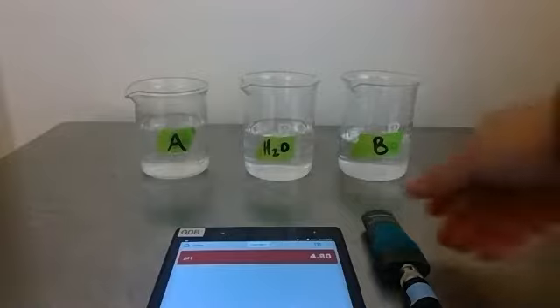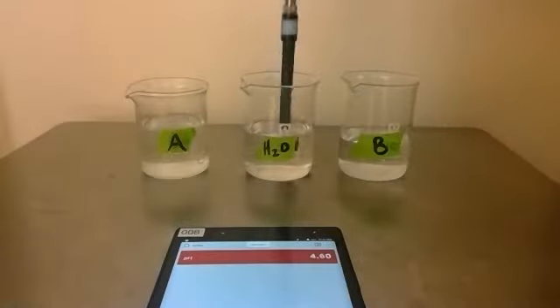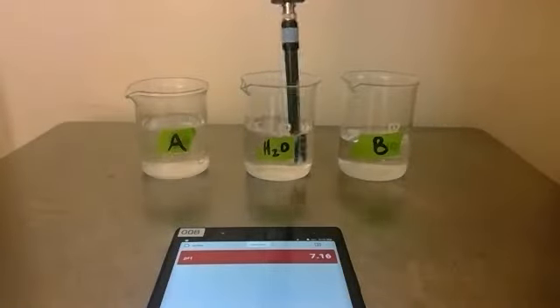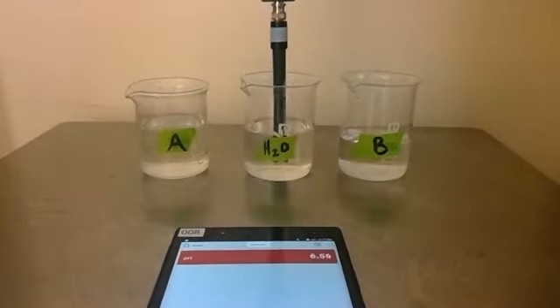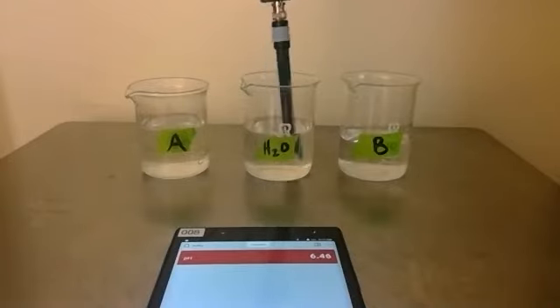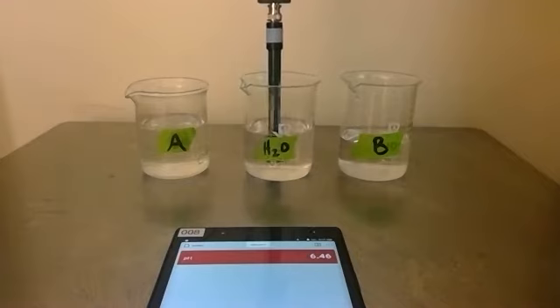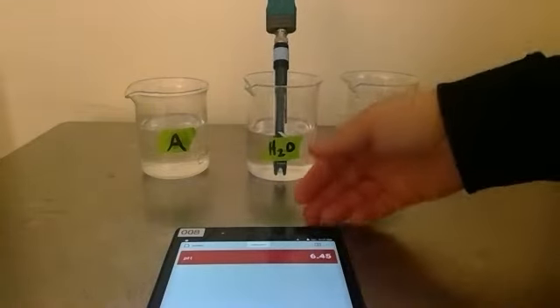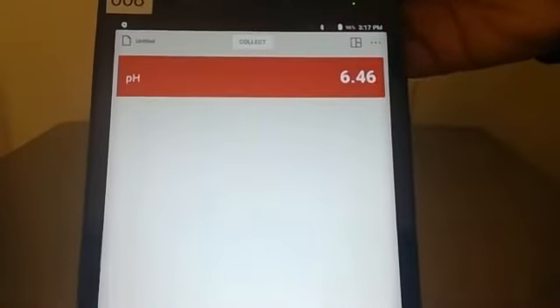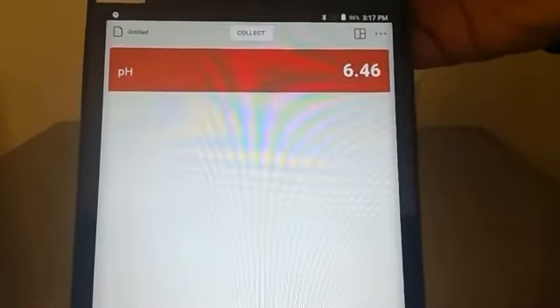Let's start with water and look at both the measured pH value and what it looks like when we add our indicator dye. Right now this is just tap water from my faucet. It's getting pretty stable. I'm going to set this here and lift this so you can read that our water right now has a pH of 6.46.